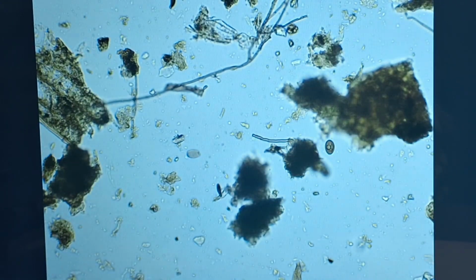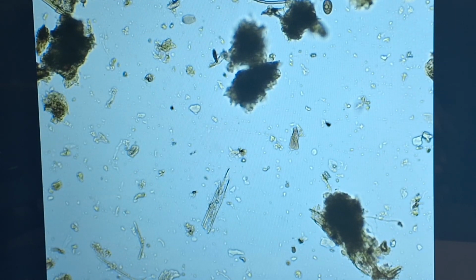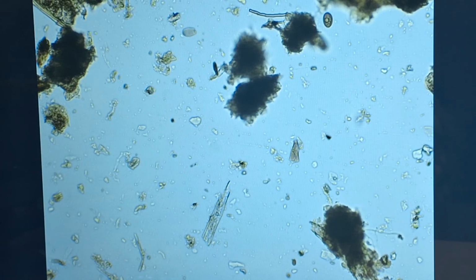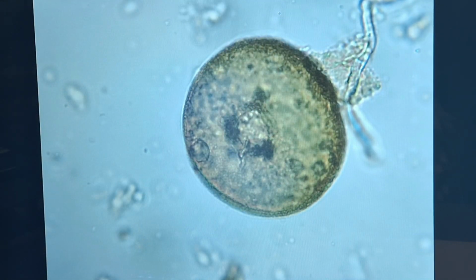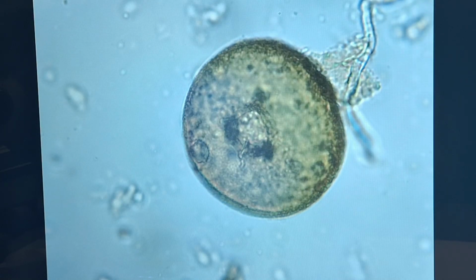Moving out, we're going to zoom back out to 100x for a moment and see if we can find some protozoa now. Looking at that first one we just saw there, see if we can find it. We need to zoom back in. That flagellate was one type, and there's the shelled amoeba. We may see some ciliates, but hopefully just the flagellates and shelled amoebas in here. There we found, I believe, an Arcella amoeba. You can see the shell around it, a shelled amoeba.